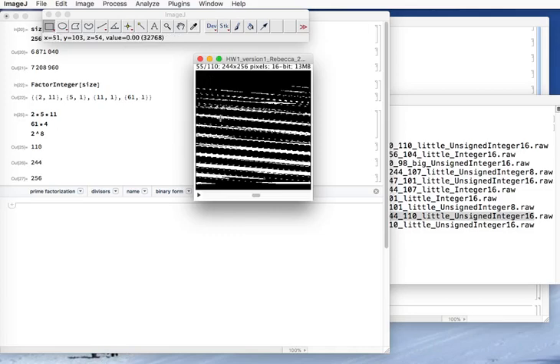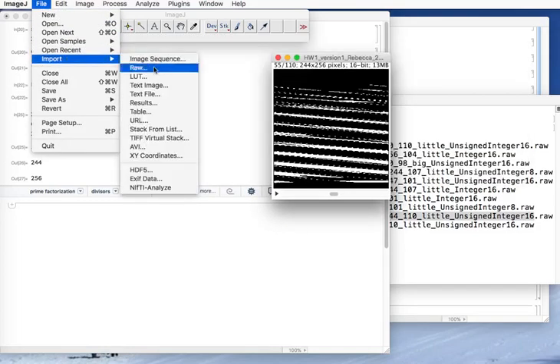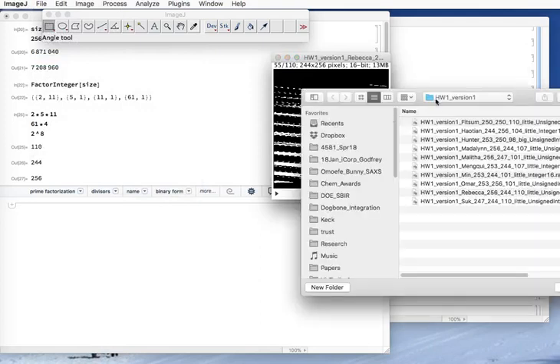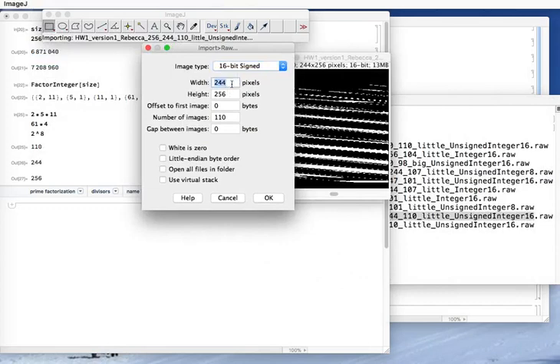And I'm going to these numbers. Well, these numbers are possibly good. Let's keep going. Let's kind of remember what we've done. I said we needed interchange. Let's do just that, interchange.